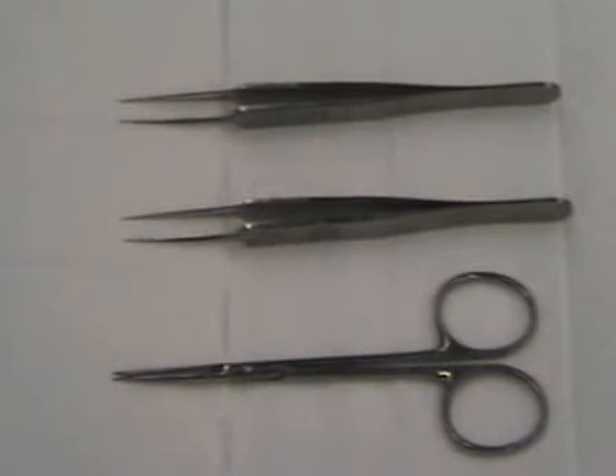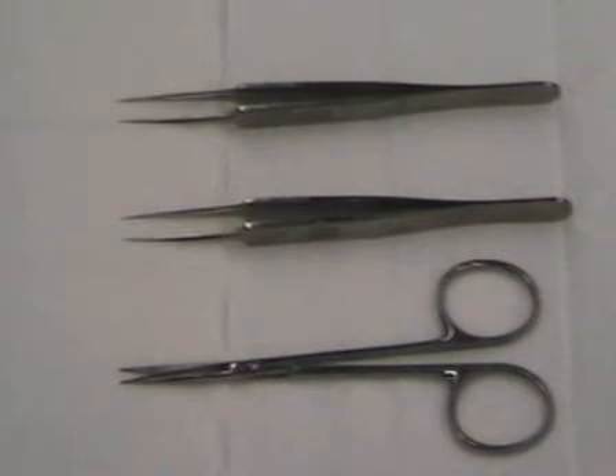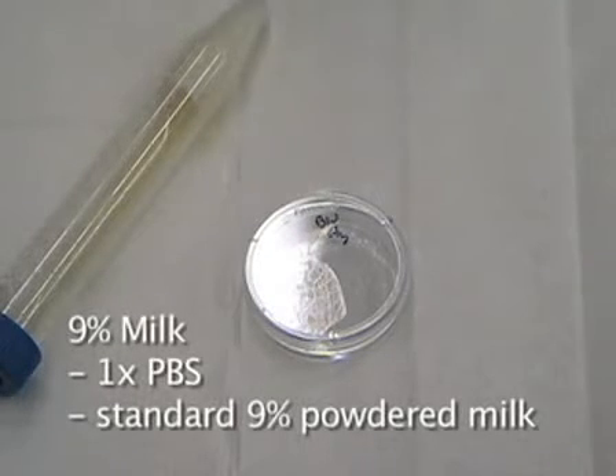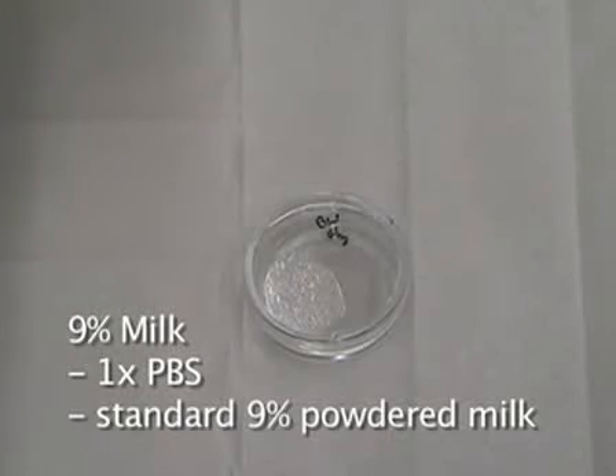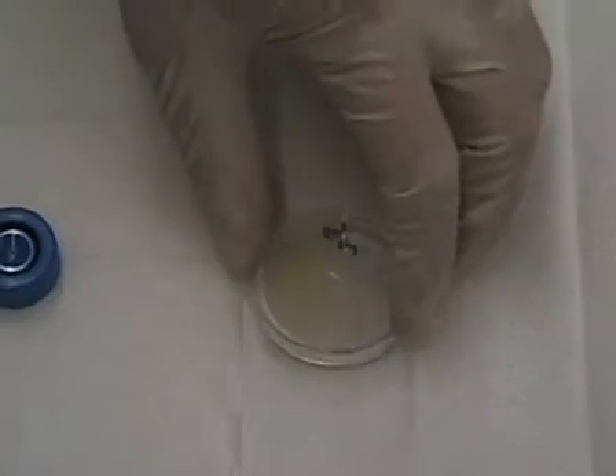The dissecting tools we'll use are two sets of sharp forceps and one pair of sharp scissors. These will be used to isolate the vas deferens all the way through the testes and the fat pad. Once that's done, we'll use the forceps to isolate the epididymis. Nine percent milk is used to shuttle the sperm into the female. It is made up of 1X PBS and powdered milk found from your local grocery store, put into a small petri dish so the sperm is in a localized area.